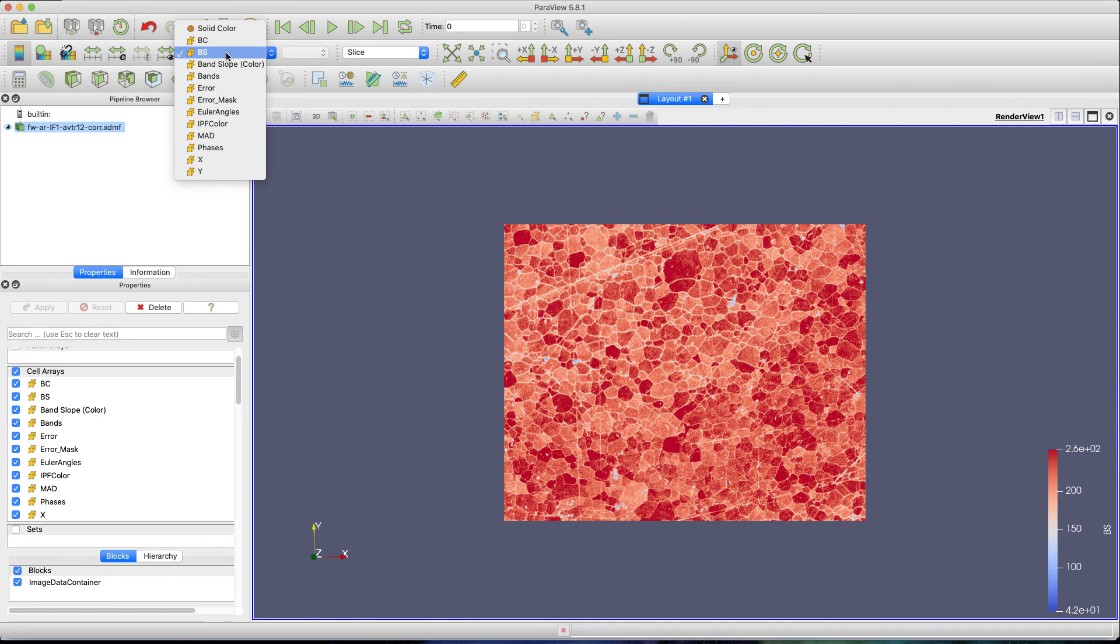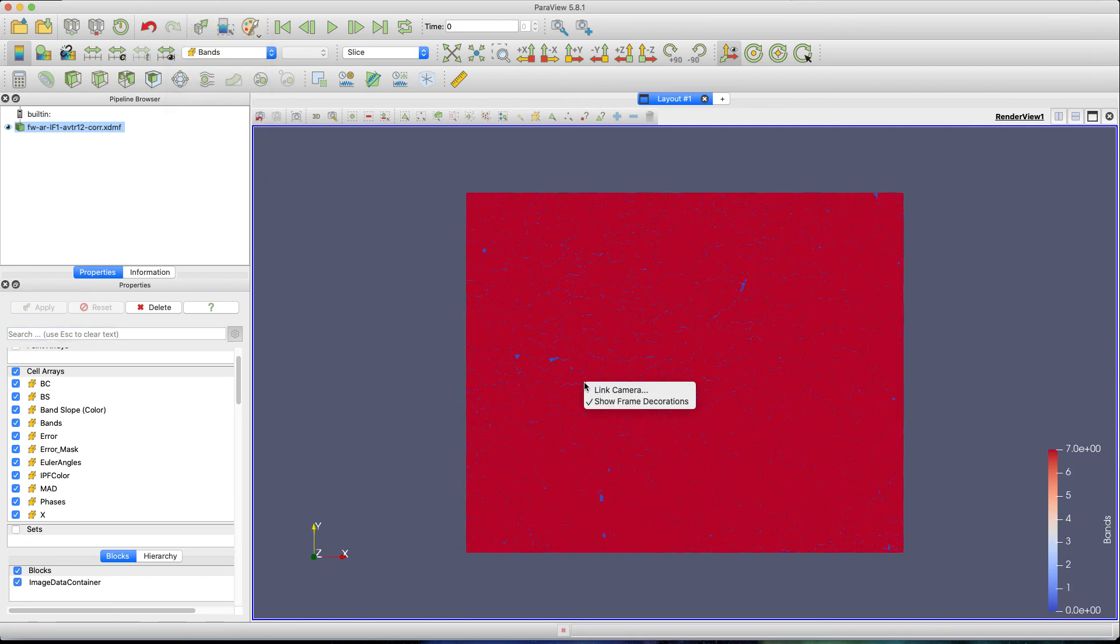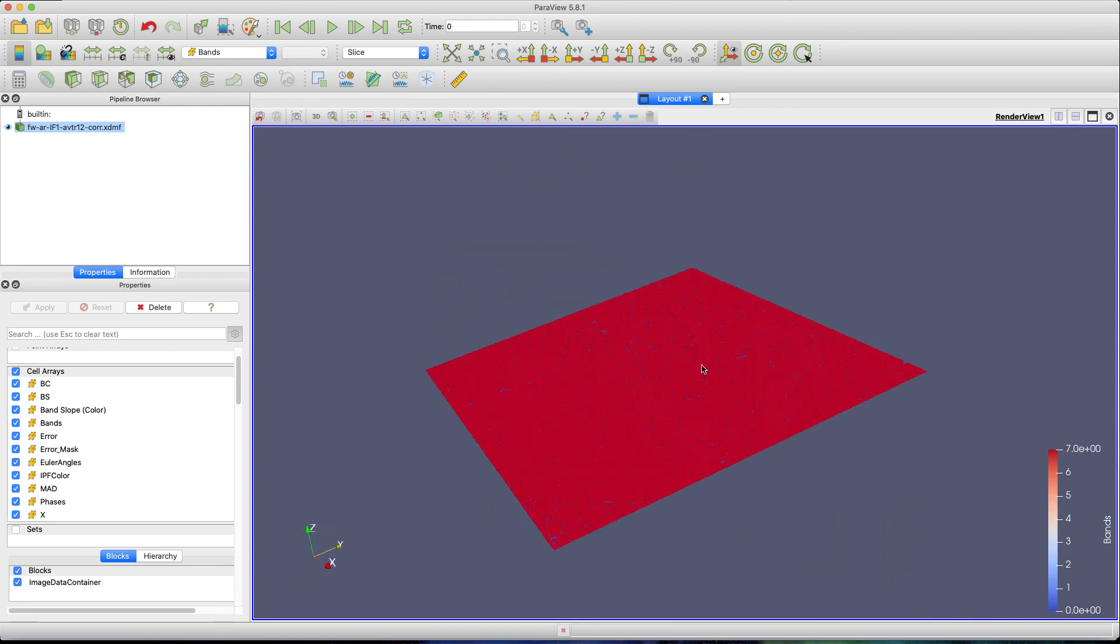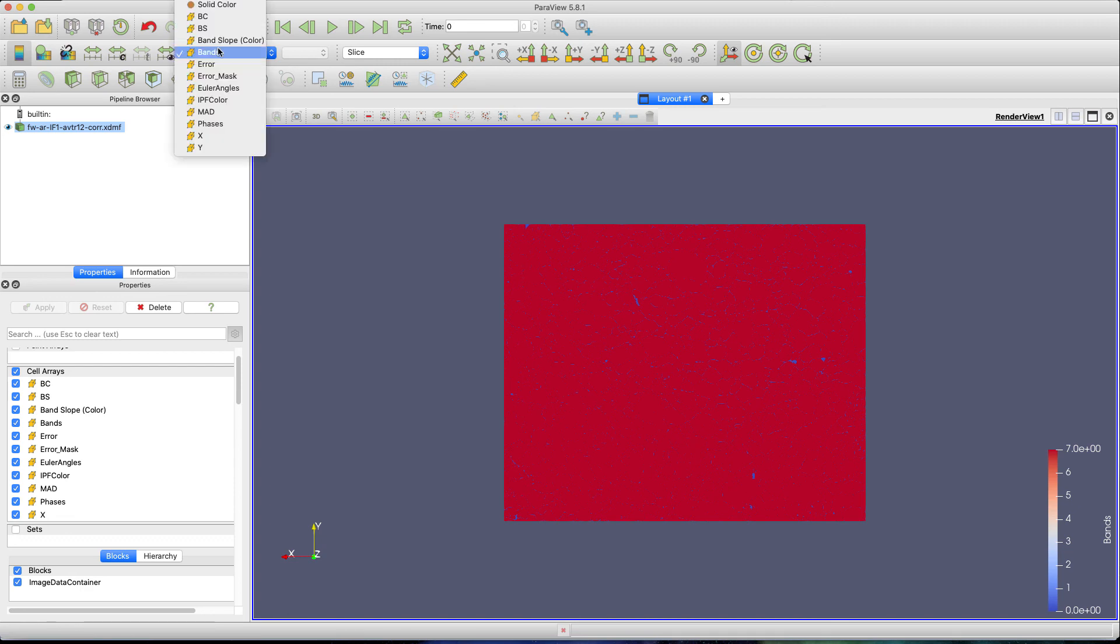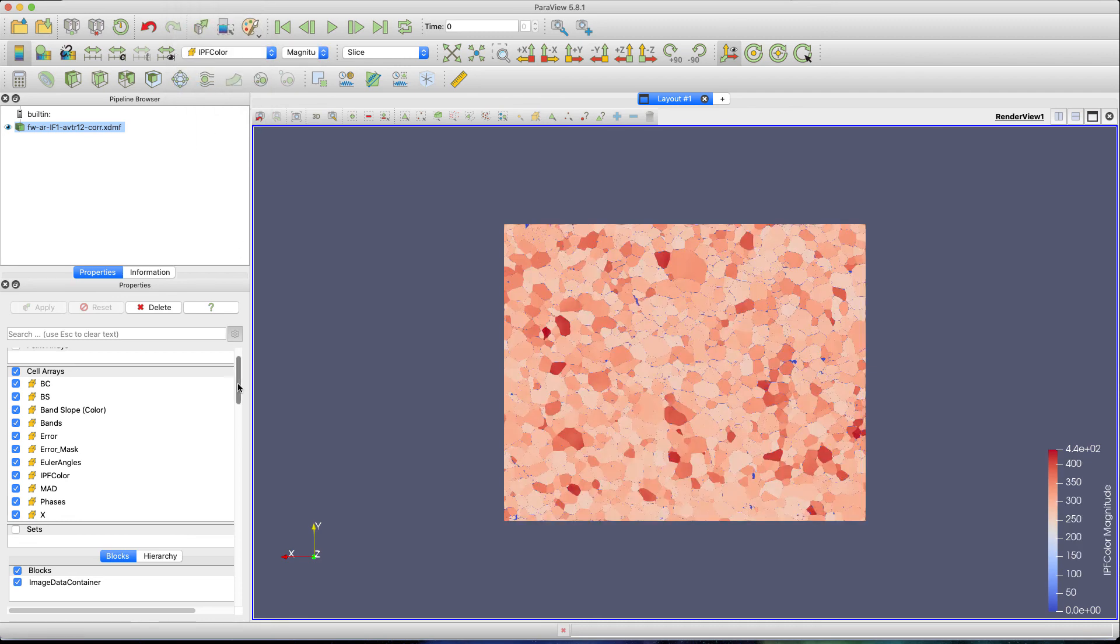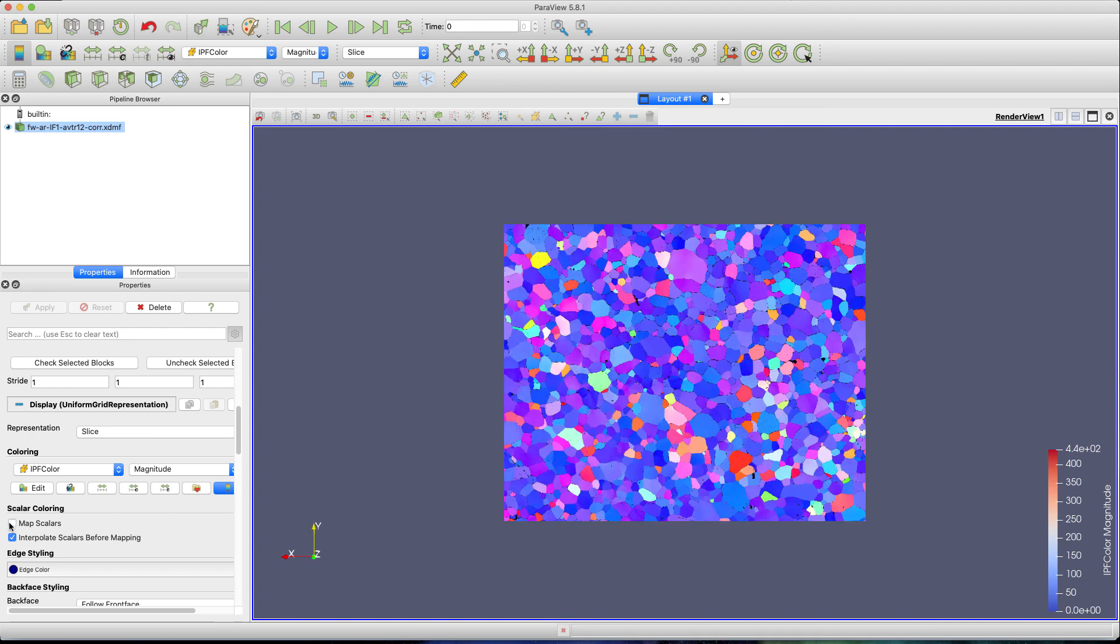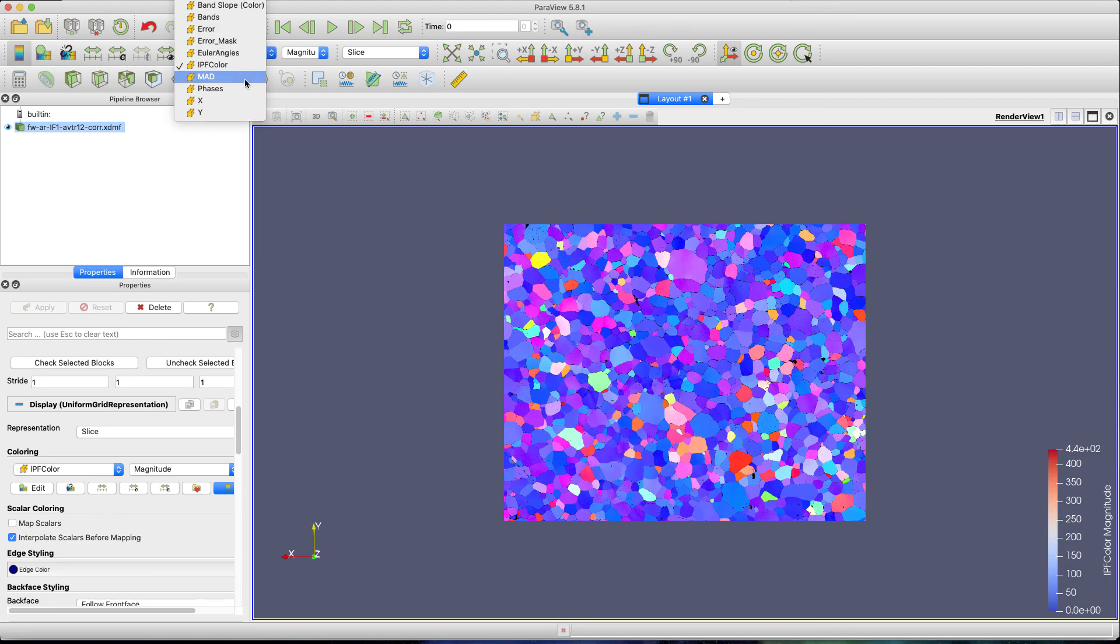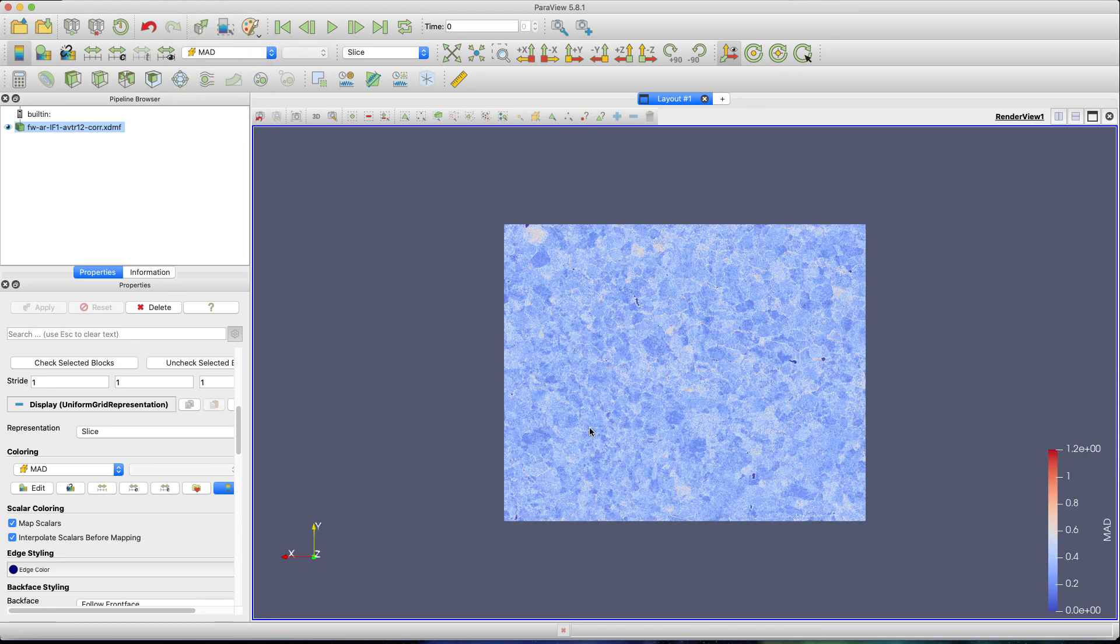Band slope, band contrast, number of bands—so you can see here again this is fully 3D, so you can twirl around it. You have quick settings: number of bands, error—which error looks like basically what was indexed and what was not. If you choose IPF color, you need to go down and uncheck this 'map scalars' because we've already generated the colors. Mean angular deviation—you want to go back to mapping the scalars—you can take a look at that also. This works just as good for 2D and 3D datasets.